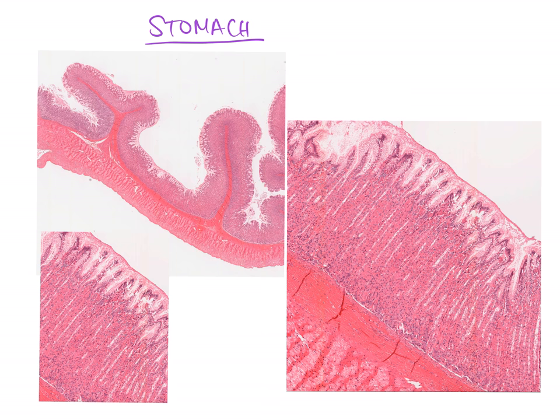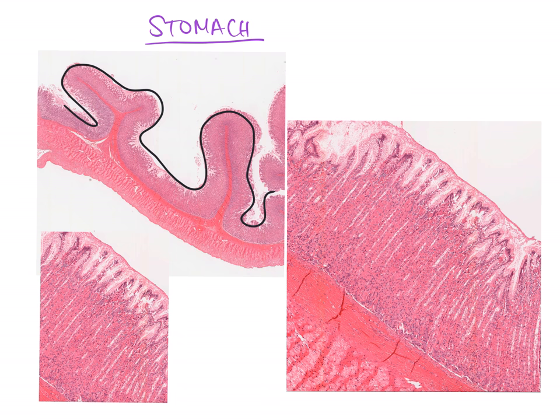Moving into the stomach: it's pretty obvious from the really nice folds — the rugae — sticking out on the surface, which you can see not just under a microscope but in real life. All four layers are visible: the mucosa layer, the submucosa as a darker pink layer, the muscularis layer, and the serosa layer at the very edge.